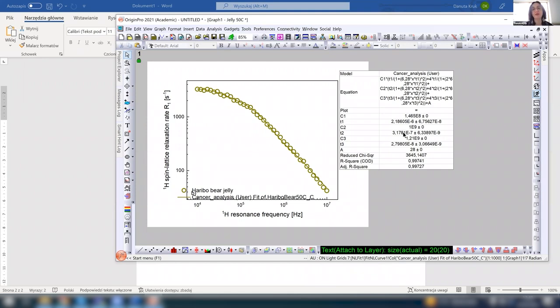Previously, the correlation time was like 4.8. Now it's more or less like 3. So the dynamics is faster. Previously, this correlation time was about 5, and now it's around 3. So this dynamics is also faster. So somehow, keeping the dipolar relaxation constant, temperature unchanged, we got a reasonable picture, because each dynamical process became somewhat faster. So it makes some sense, I think.